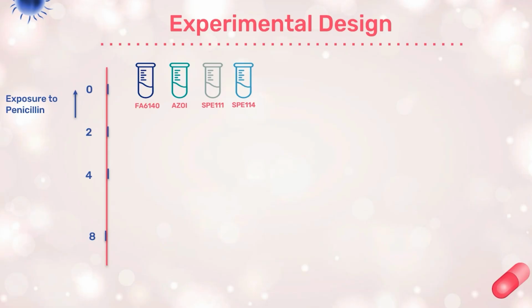So, just a reminder, we took samples at 0, 2, 4, and 8, and we added penicillin after time point 0. So we'll see the effect of penicillin when we analyze data for time points 2, 4, and 8. After collecting the samples, we did viability assays to basically confirm that cells were growing as we expected. And then we prepped the samples and sent them out.